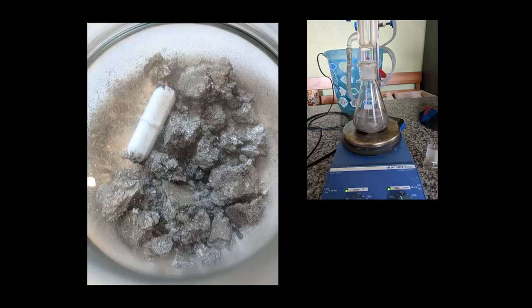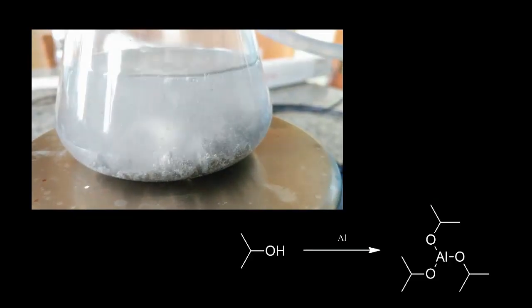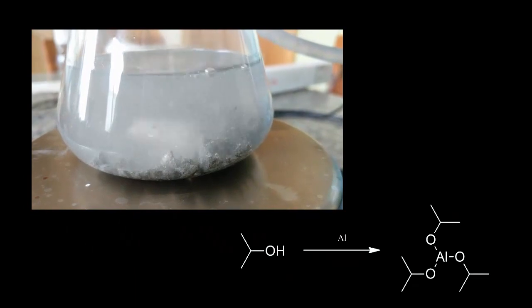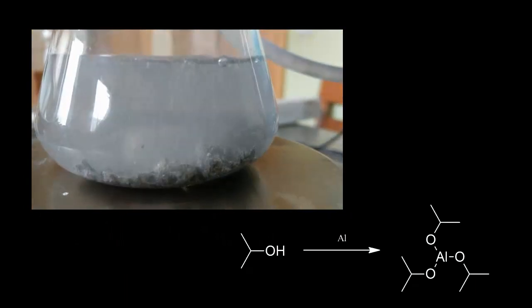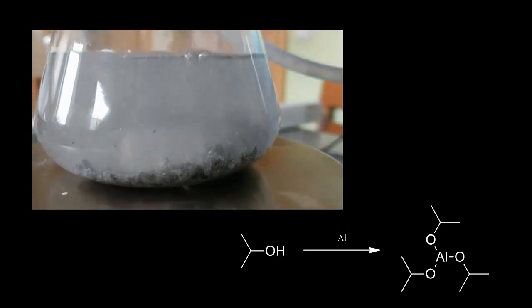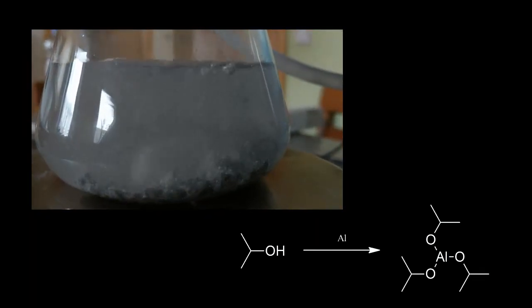Actually, NurdRage did a video about aluminum isopropoxide, except that he activated the aluminum with mercuric chloride, and so we can use our activated aluminum instead. I've provided a link to NurdRage's video in the video description.